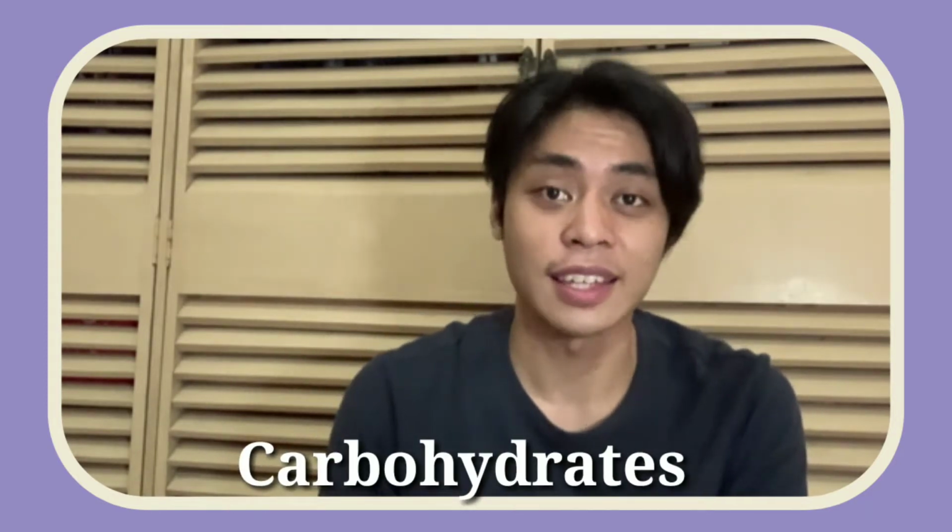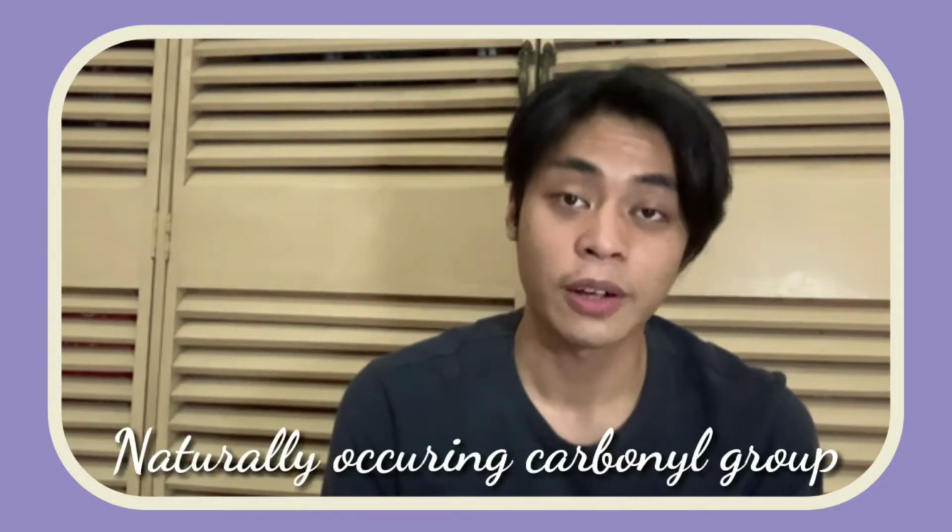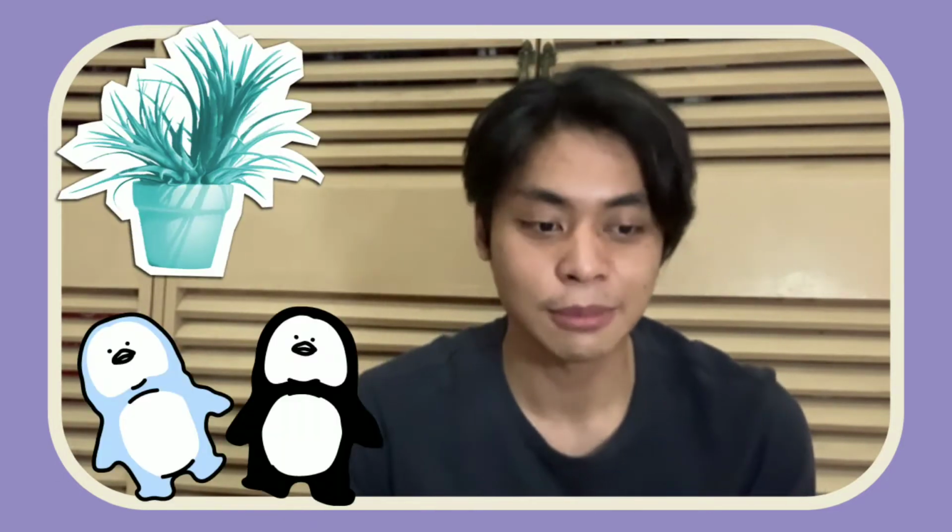Today, we're going to be taking a look at carbohydrates in this experiment entitled Jelly, Jelly, Yes Papa. Let's get right to it. So, carbohydrates are naturally occurring carbonyl groups found in plant and animal cells.